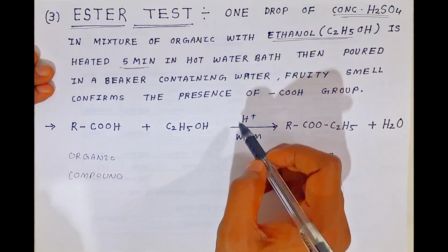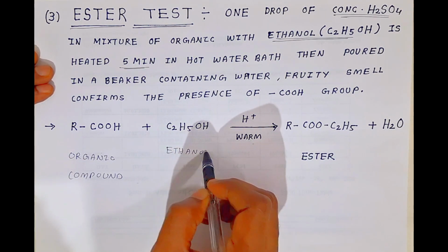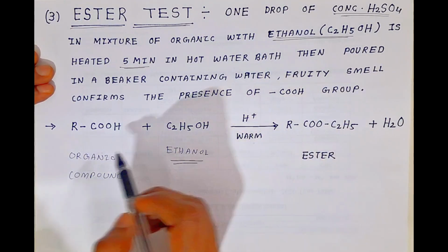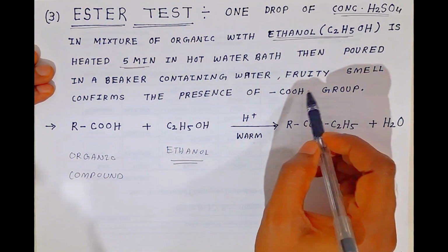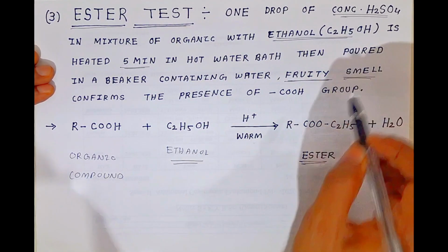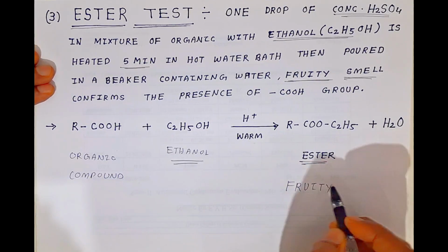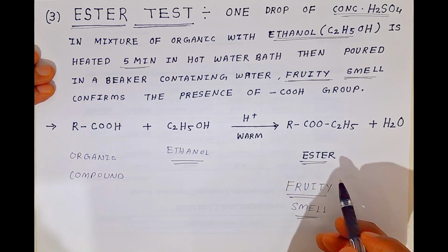This is ethanol, students. This ethanol will form the ester. There is an esterification reaction that takes place, and esters always give you a fruity smell.